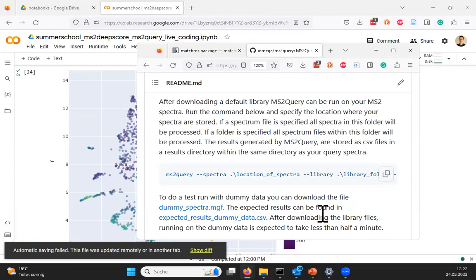So this is if we run the data that we get straight out of MZmine, the MGF files, with MS2Query. Then we get, for every spectrum, the best hit according to MS2Query in the GNPS library. And this doesn't mean that it's a good hit, right? Because it can be that you have compounds or spectra in your MGF file that are very, very different from what you have in GNPS. MS2Query will still give you a prediction, but it will not be great.